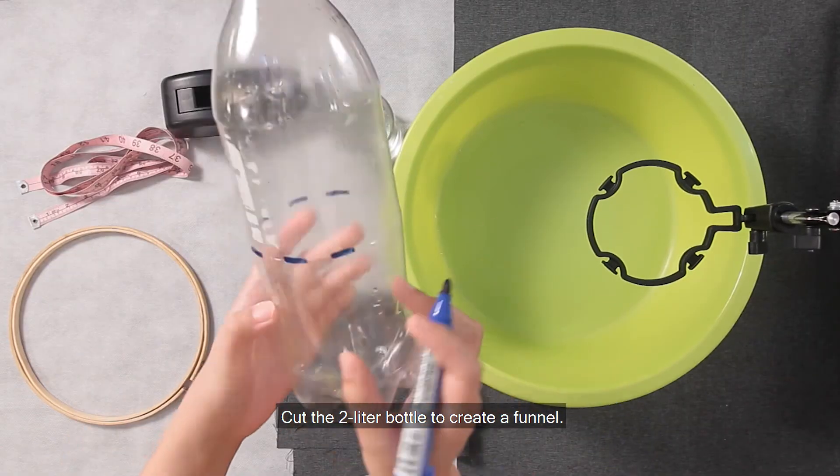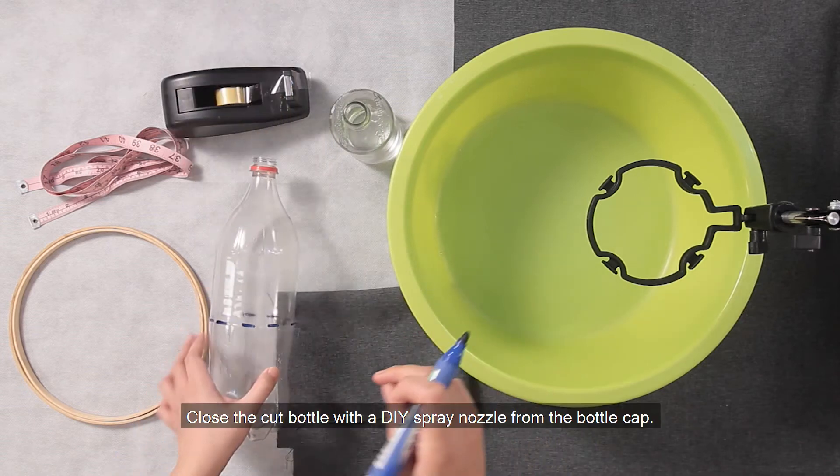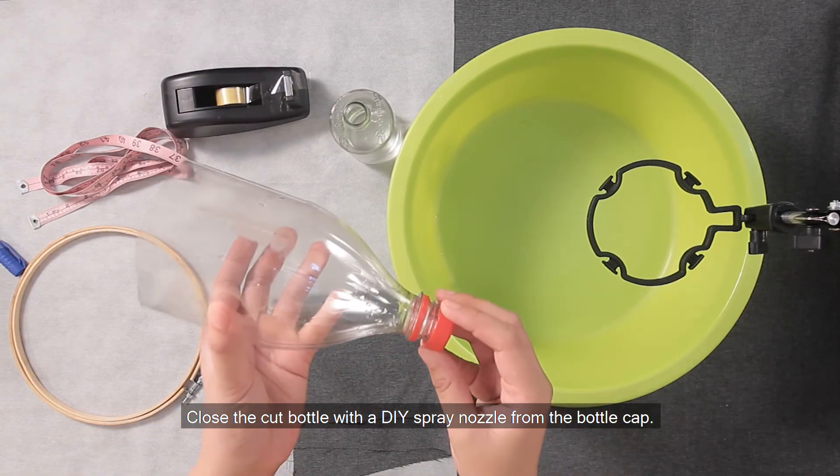Cut the 2-liter bottle to create a funnel. Close the cut bottle with the DIY spray nozzle from the bottle cap.